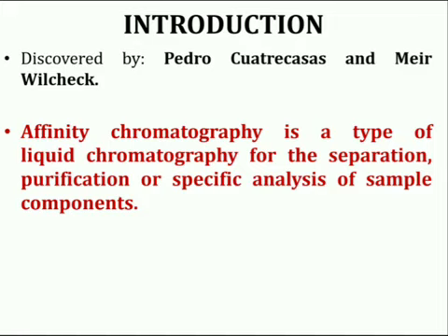So affinity chromatography was discovered by Pedro Cuatrecasas and Meir Wilchek. It is a type of liquid chromatography particularly used for the separation, purification, identification and specific analysis of sample components.